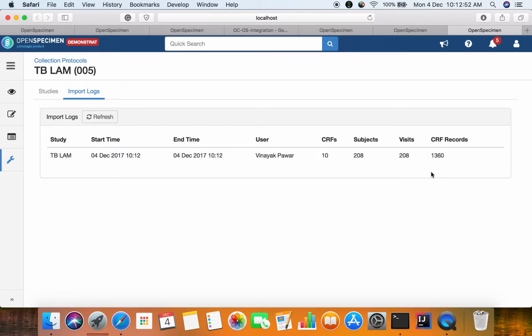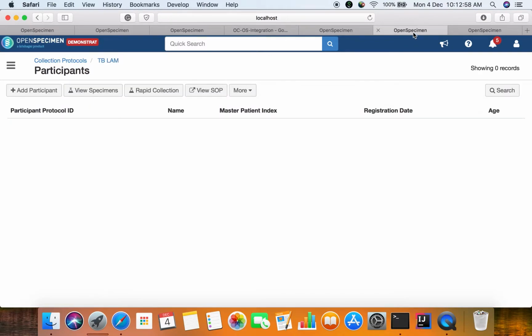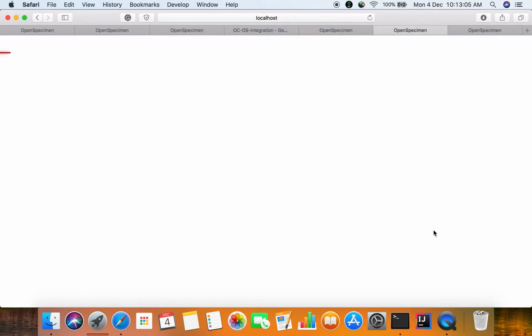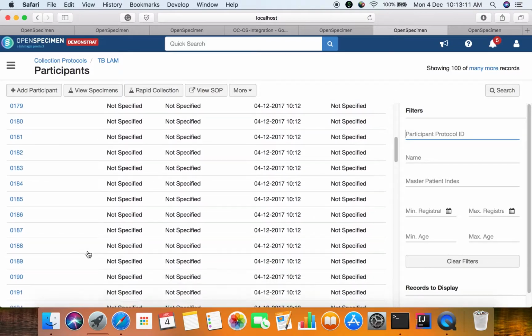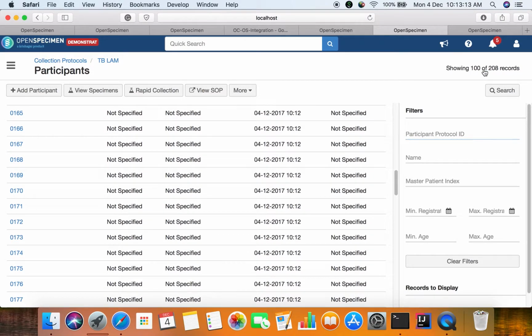So it has created 1360 CRF records. Okay, now let's go to the participants list view and see whether the participants are appearing now. So what we will do is we will refresh this page. Okay, so we refresh this page and we see that the participants are created here. Okay, you can see here.